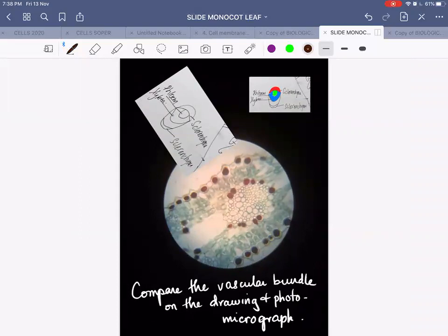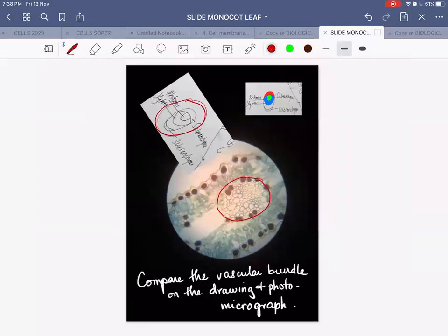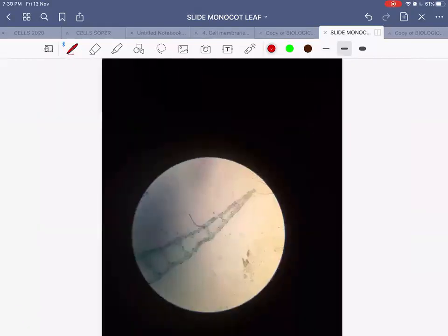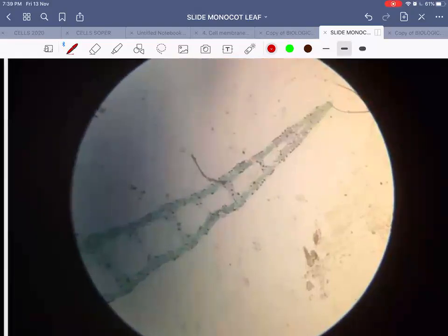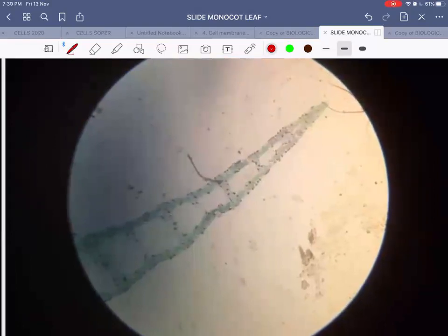A high power photomicrograph of the same leaf shows the palisade mesophyll cells more clearly and the vascular bundle, helping you draw those layers accurately. The xylem, phloem, and sclerenchyma shown in the drawing match what you see on the photomicrograph. A low power photomicrograph of the monocot leaf confirms all the different layers as seen in the drawing.